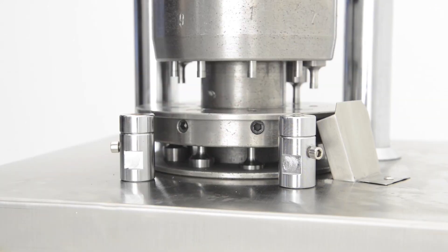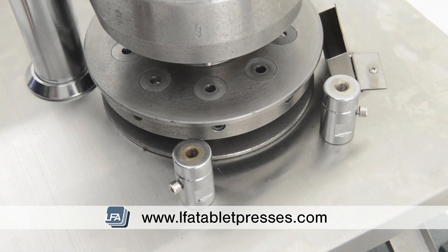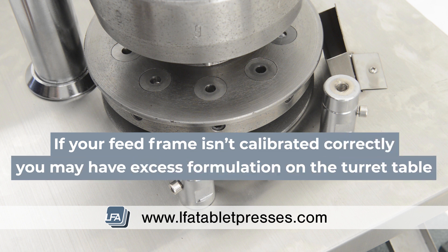Welcome to LFA's guide on adjusting your RTP9 feed frame. Knowing how to calibrate your feed frame is critical to the good running of the press. If your feed frame isn't calibrated correctly, you may have excessive formulation across the turret table and die faces.